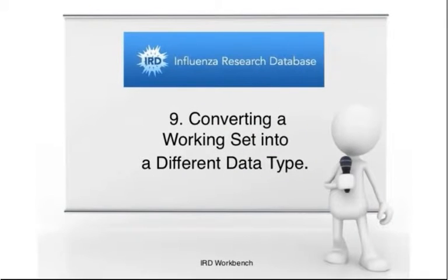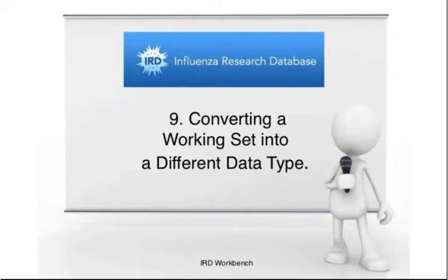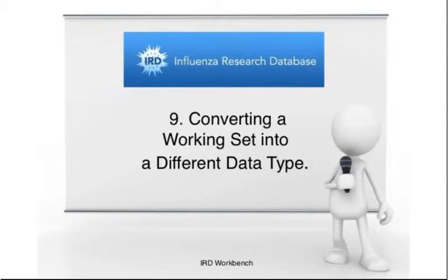Converting a working set into a different data type. If you have a saved working set, you can change the data type that is associated with it. For example, if you've done some analysis on a working set of nucleotide sequences, and now you want to analyze the same strains on the amino acid sequence level, you can easily convert your working set of nucleotide sequences into a working set of protein sequences.